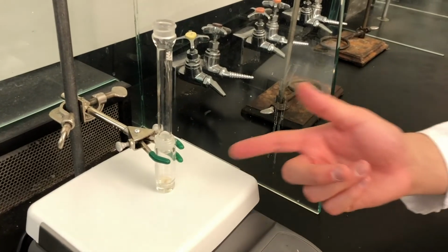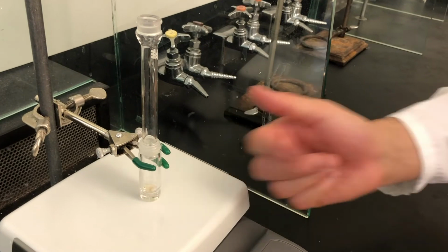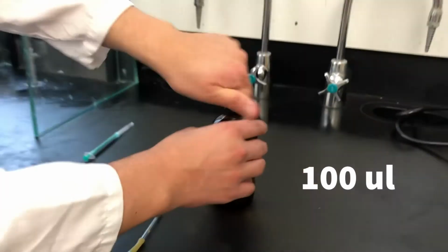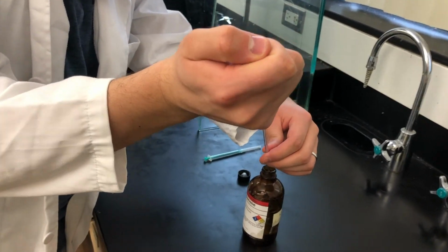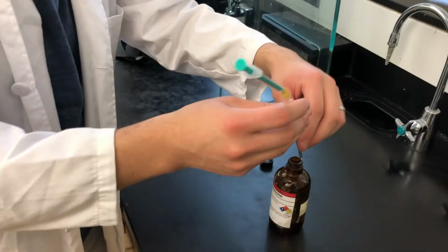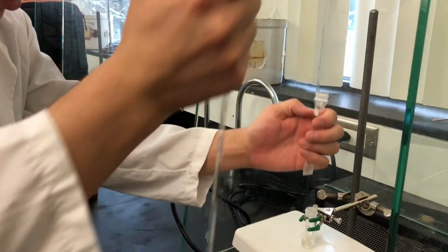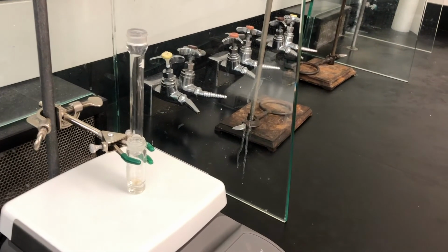Okay guys, we're going to start the reduction of a ketone lab. Here's what the apparatus looks like for the beginning. We have a 5 ml conical vial, we have an air condenser, and we have a large spin vane in there. And we're going to add 100 microliters of cyclohexanone. Okay, so we've added the 100 microliters of cyclohexanone.